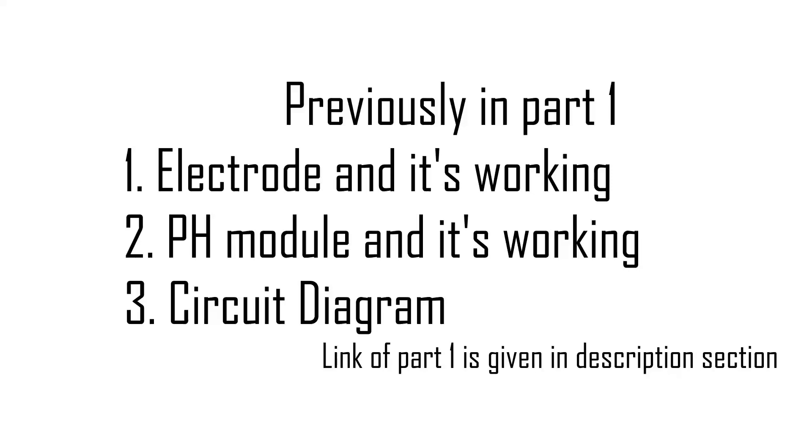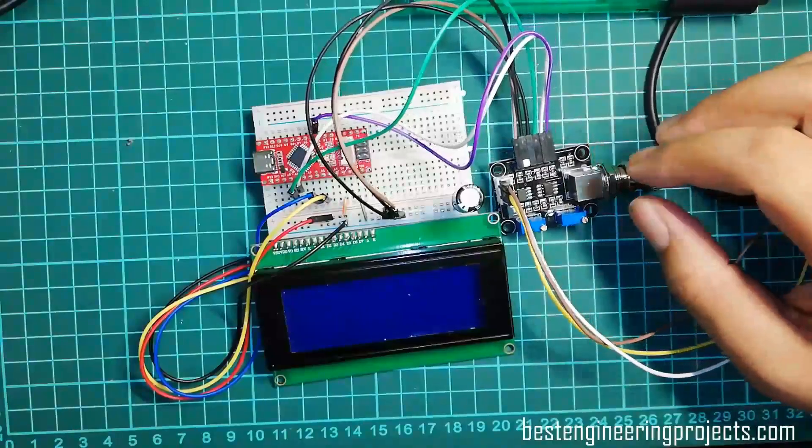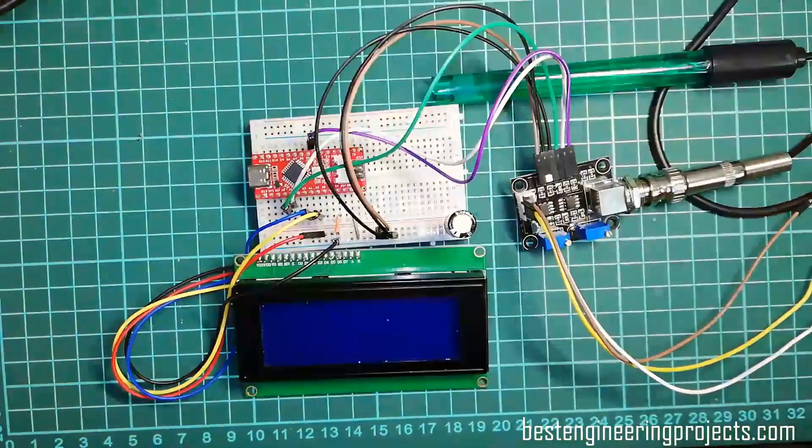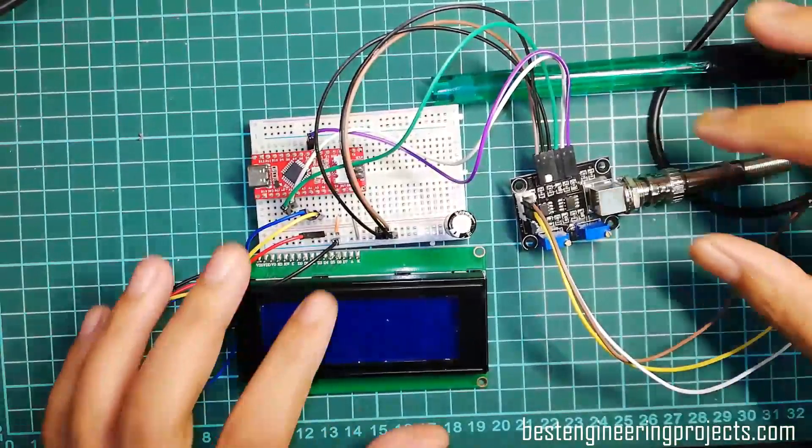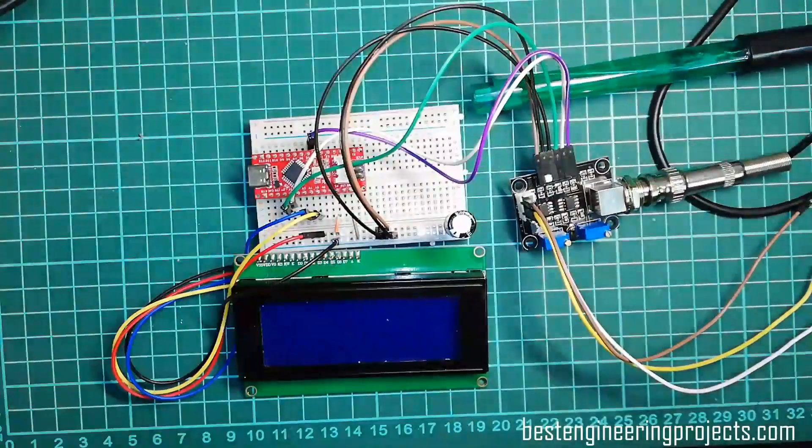Now let's start with calibration of the pH module. Step 1: Connect all the components as shown in circuit diagram. As we had already done the entire connection, we can jump to step 2.